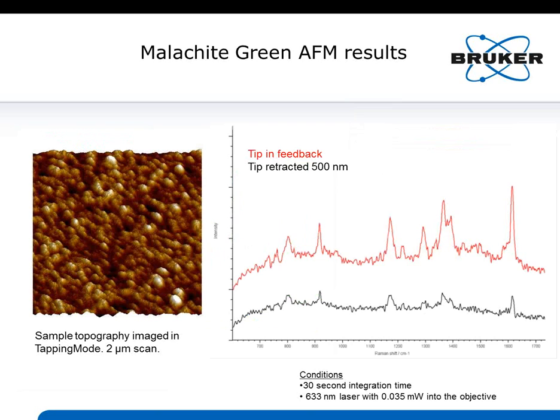You can do the same thing with an AFM tip. With AFM tips, the bigger problem up to this point is that when people use wires, it's a solid metal, and the procedures for etching these wires are well defined. When you use an AFM tip, for the most part, people coat these AFM tips with metals, and the coating is often not as stable as a solid metal tip, meaning you have to use significantly less power.